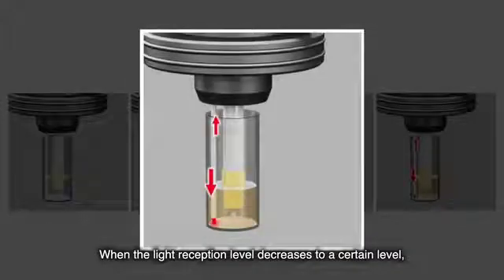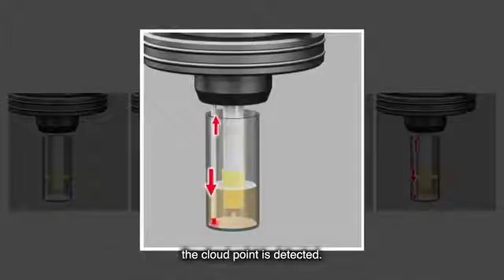When the light reception level decreases to a certain level, the cloud point is detected.